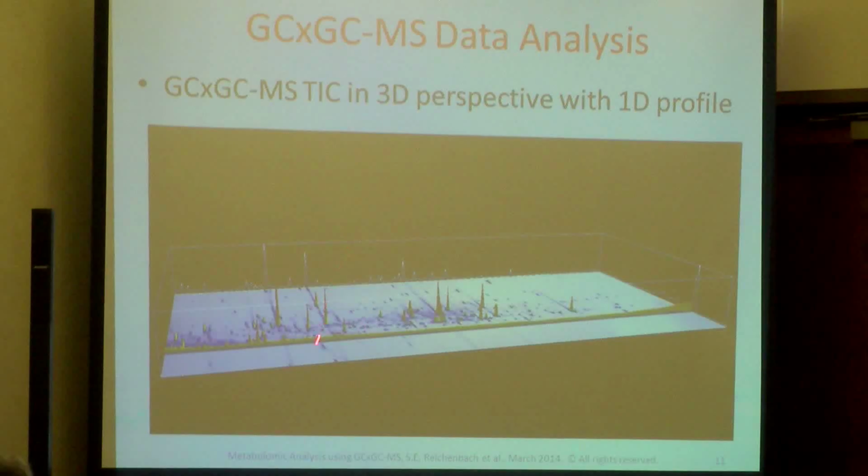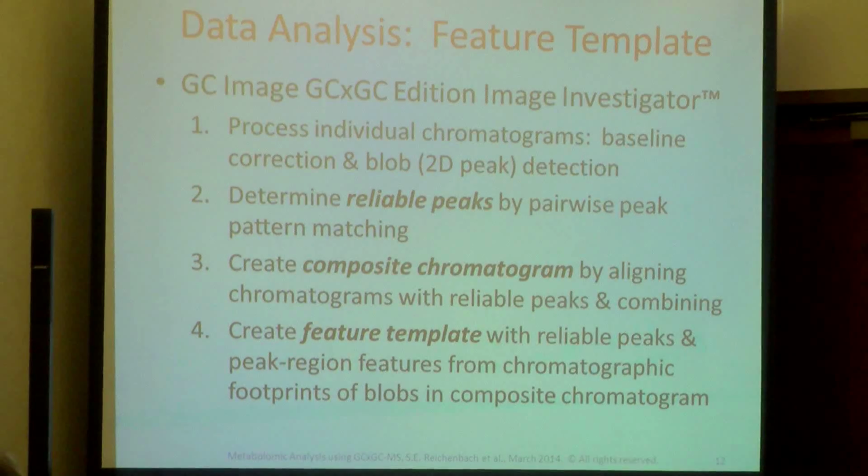The third dimension is, in this case, the total ion intensity chromatogram, the digital number produced by adding all of the ion counts at each level of the mass spectrum. So the primary focus of this work is how do you extract the data from each of these chromatograms? How do you align all of the data across samples so that you can compare, in this case, just a few chromatograms, but in the larger studies we've done, up to hundreds of chromatograms.